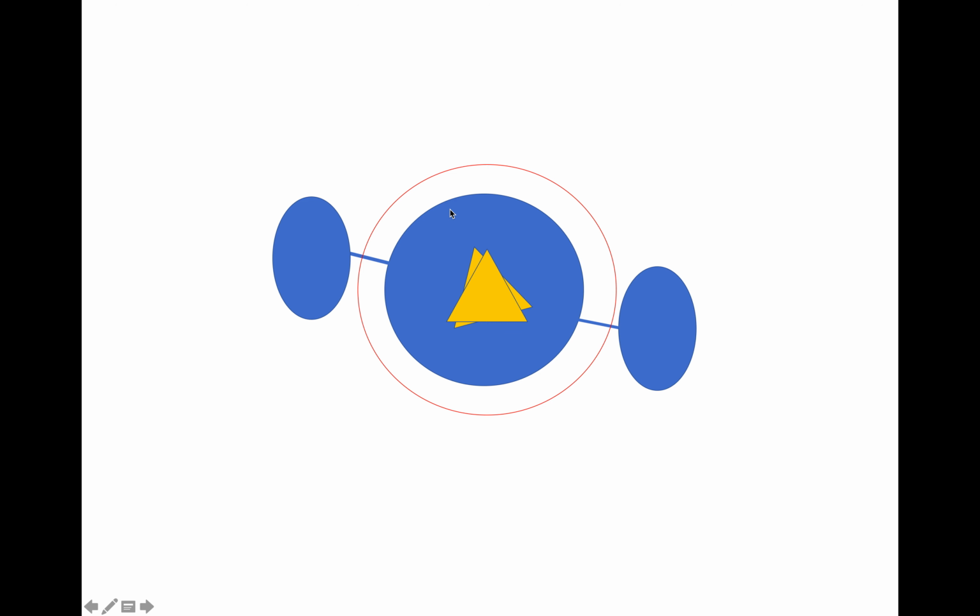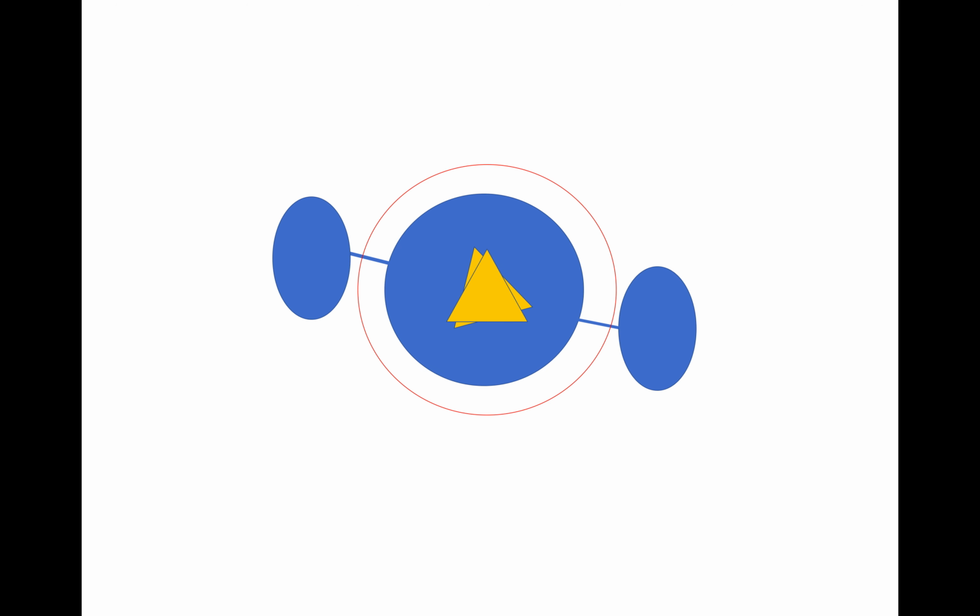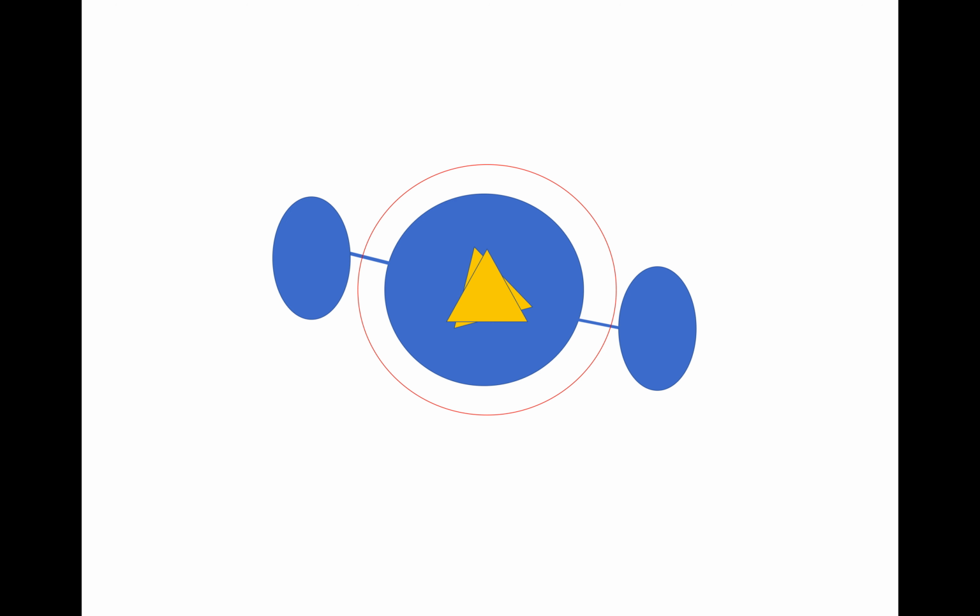So this brings up two instances where you might apply a mask: to the whole particle, or within the particle to mask out any variable regions that you want to classify with 3D variability later on. Ideally we would apply that mask and come up with something like this, where we have a perfectly aligned center particle and we don't see the external regions.